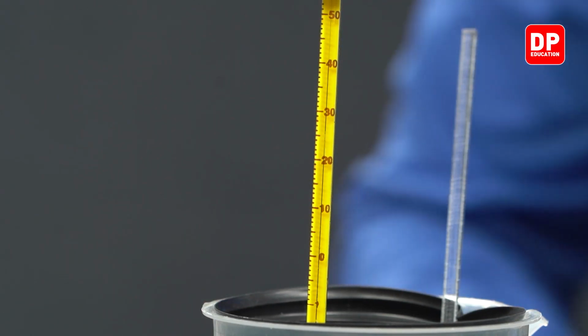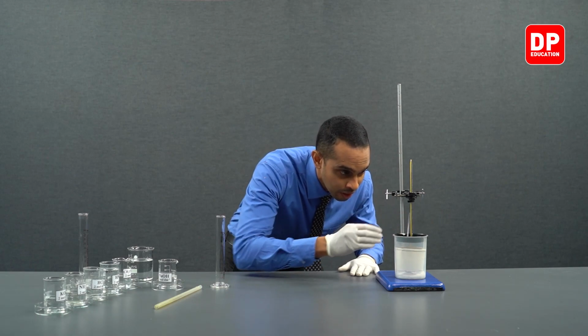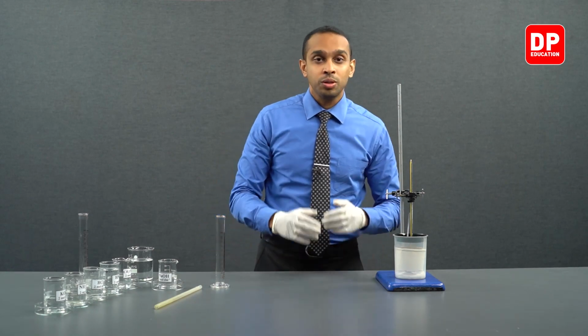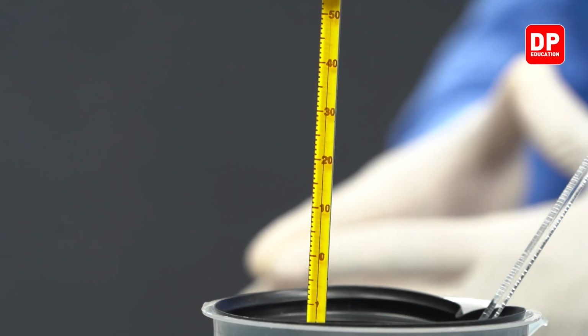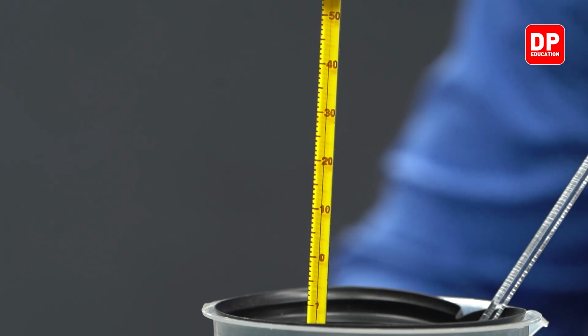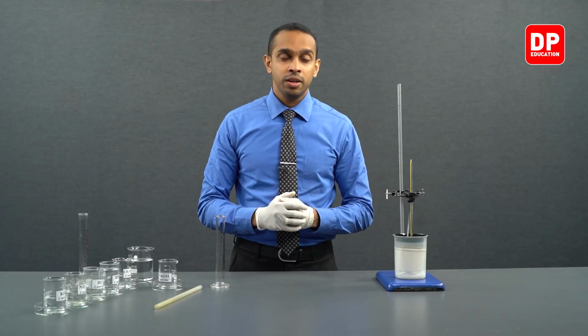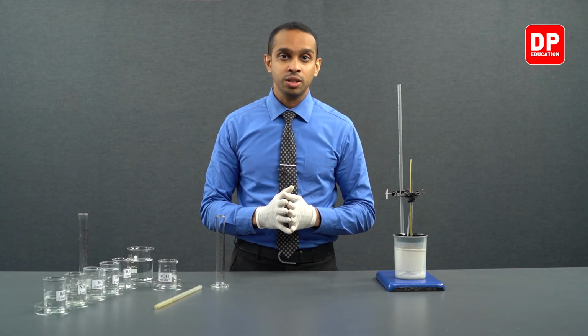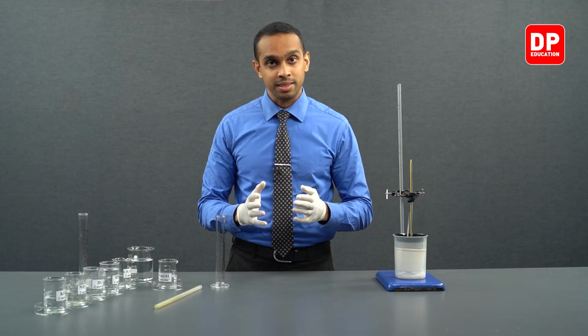And we have to observe the highest temperature it reaches when the reaction starts to take place. Now the temperature is at 40 degrees Celsius. We have to observe the highest temperature that it reaches over the course of 1.5 to 2 minutes.